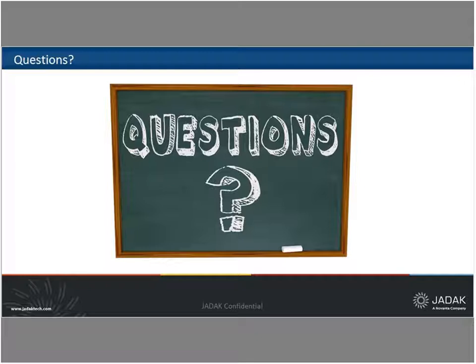One of the big advantages of the HF technology is in the discrimination. The short read range, which you might think is a disadvantage, actually comes out to be a positive when you want to make sure you're reading exactly the tag that you want to read. So that's why it's used a lot in the clinical space. And then the other reason is because of the memory capability of the tags.